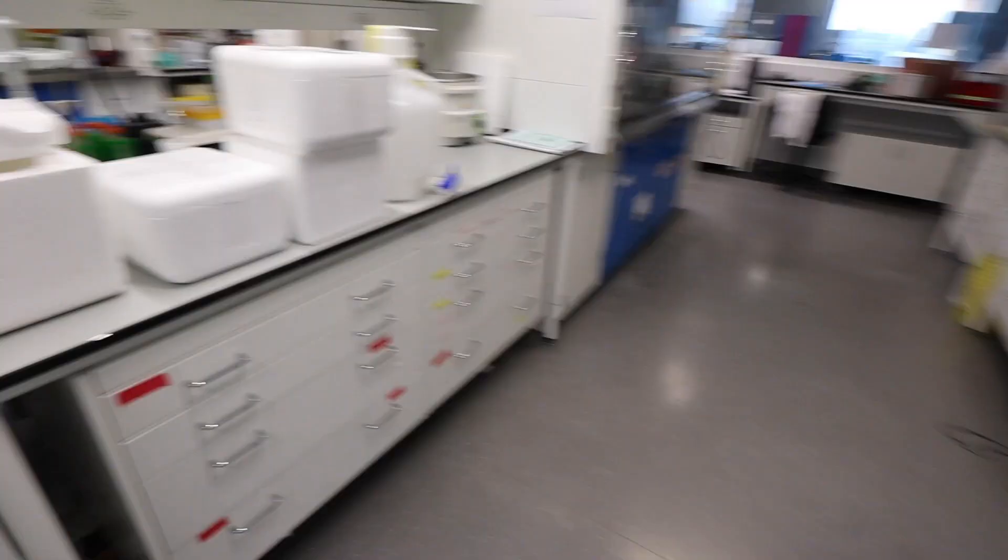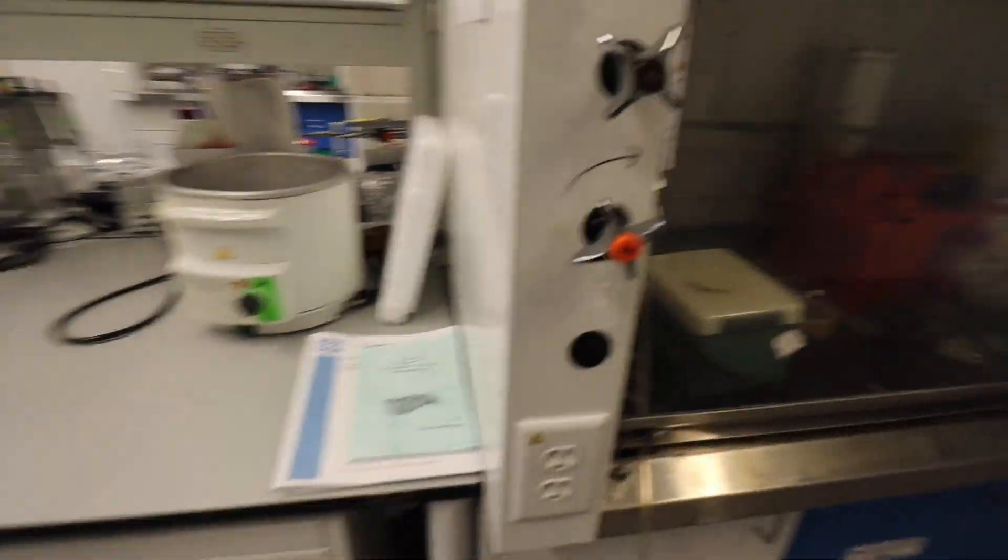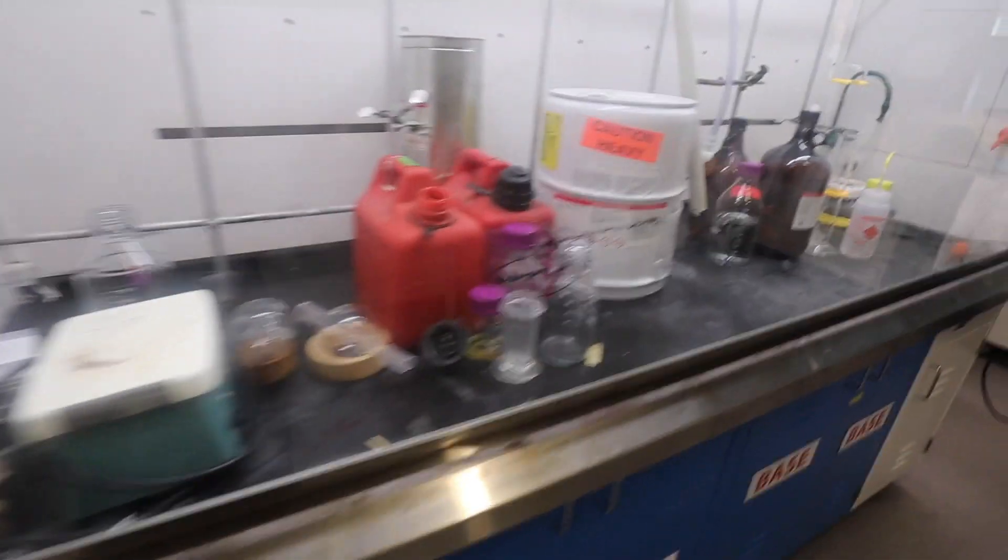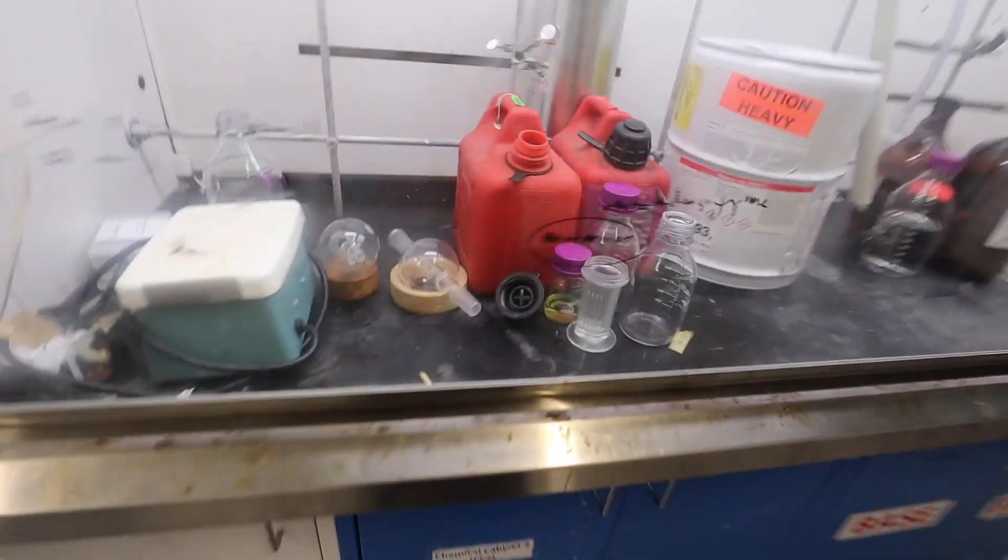So right away when you walk in, this used to be KK's lab space but he finished his postdoc and he is working now so this is not occupied by anybody but as you can see we use it for solvent storage now apparently.